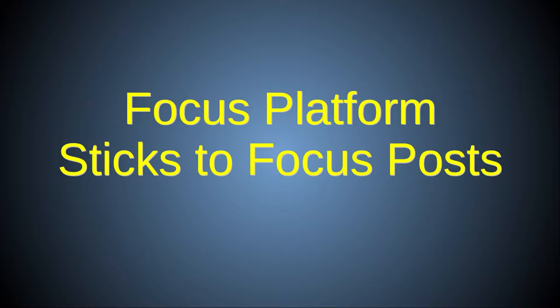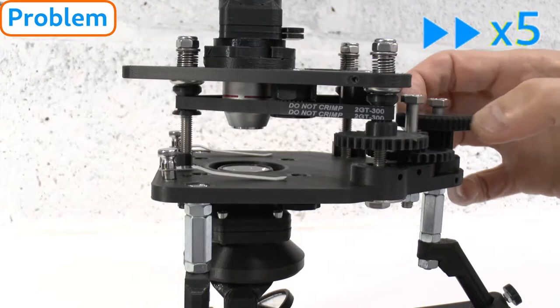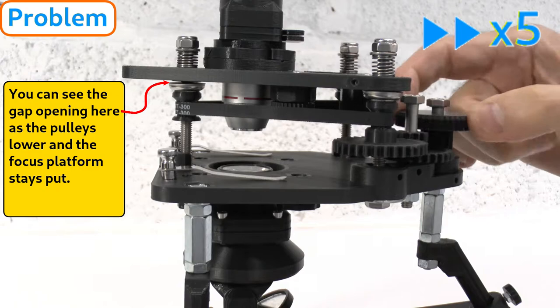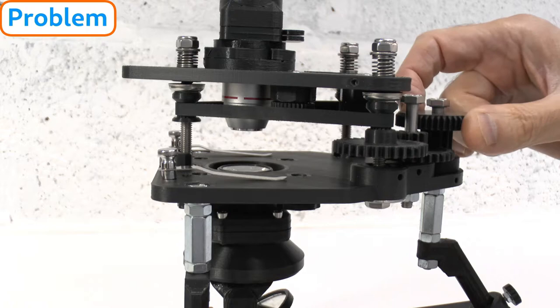First I'll address the issue of a sticky focus platform. This refers to occasions when you try to lower the focus platform using the focus controls but the focus platform doesn't follow the pulleys as they go down, because it gets stuck on the focus post threads. This manifests as failure to focus despite turning the focus gears, and it can also make the focus platform unlevel, resulting in uneven focus across the field.